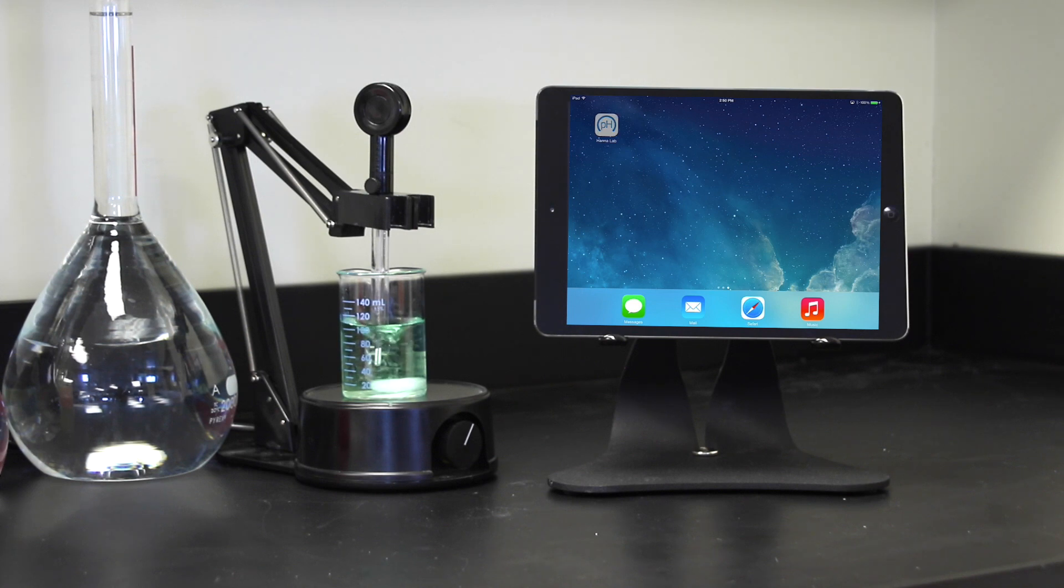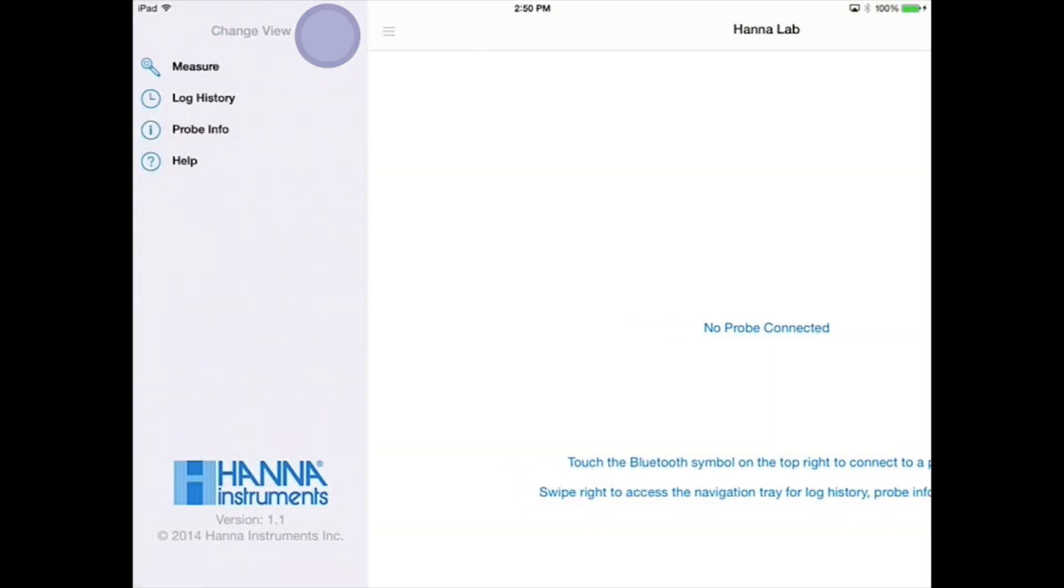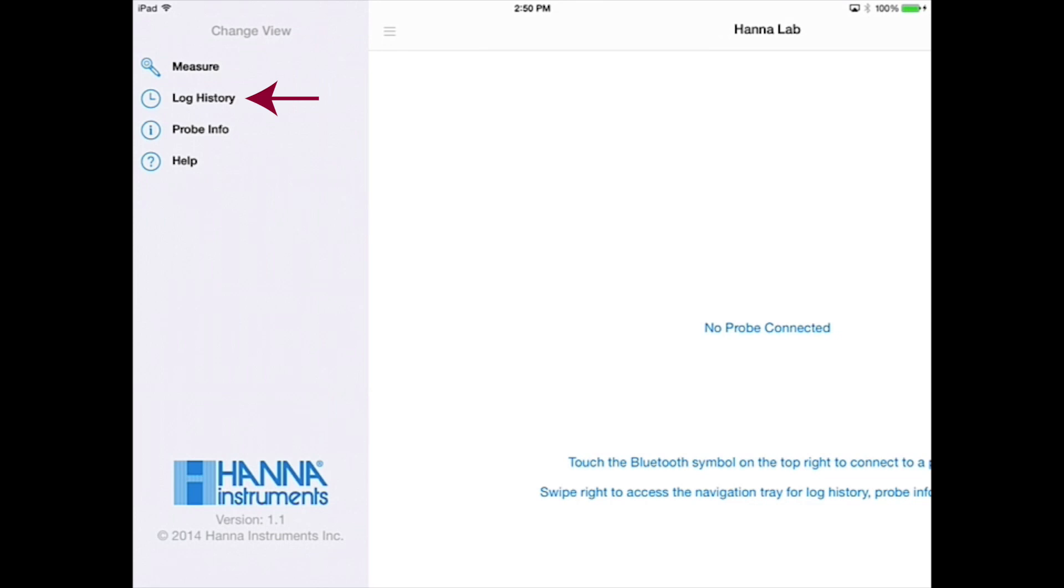Once you open the app, swipe to the right to open the navigation tray. There you'll see selections for the four primary views: the measurement screen, the log history, probe information, and help. Choose the measurement screen.